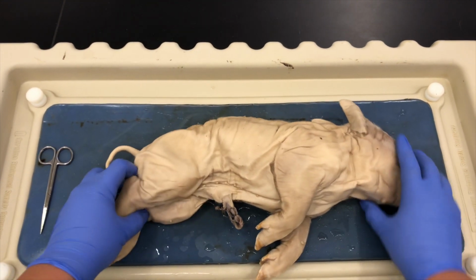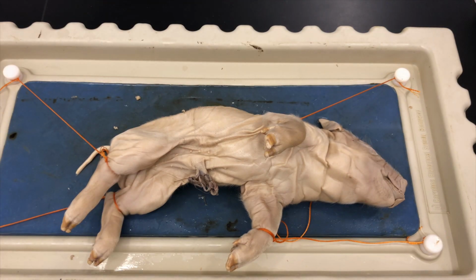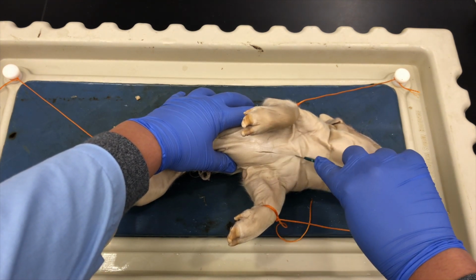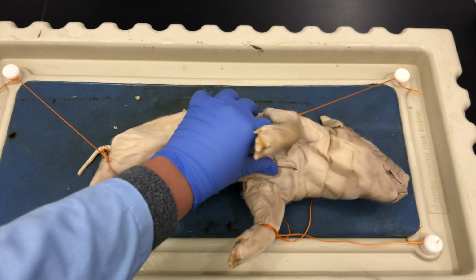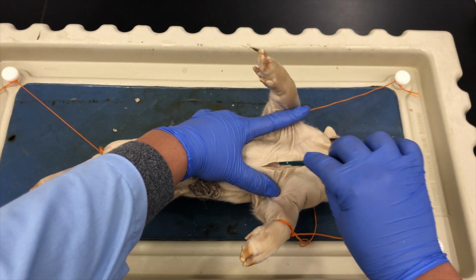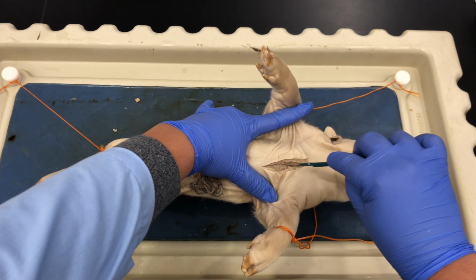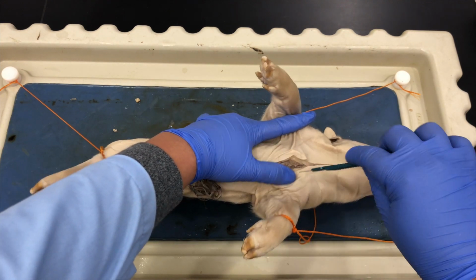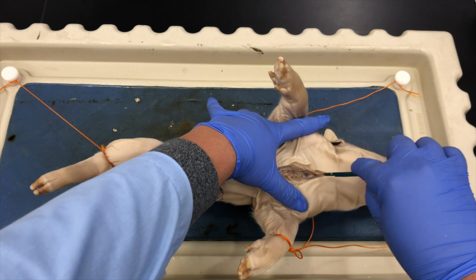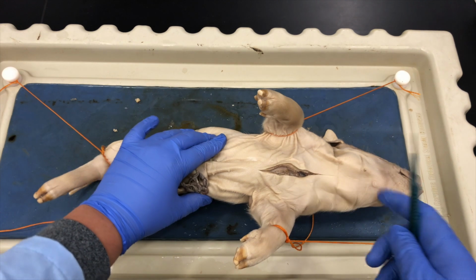Next, I will tie up and dissect the fetal pig. Here I have the fetal pig already tied up, and I will begin with my first incision. I will be using a scalpel for the majority of the dissection. With this first cut, I was going between the forelimbs all the way to close to the neck, cutting very carefully, trying to be careful not to cut myself and not to cut too deep to avoid damaging the internal organs.